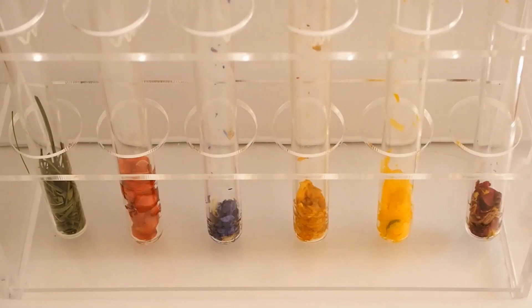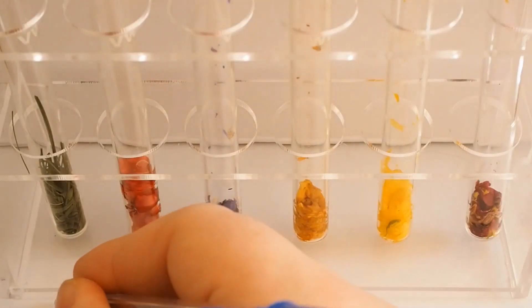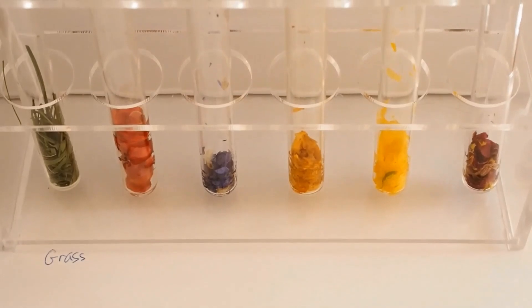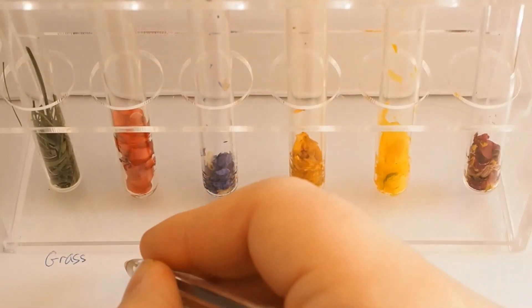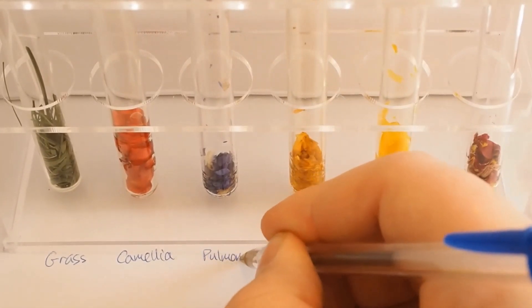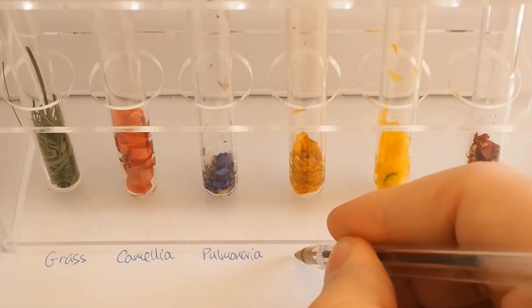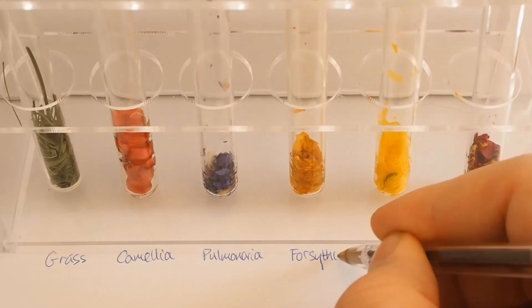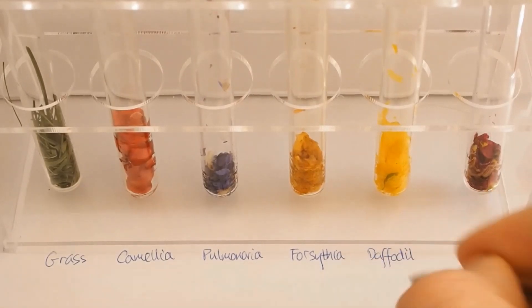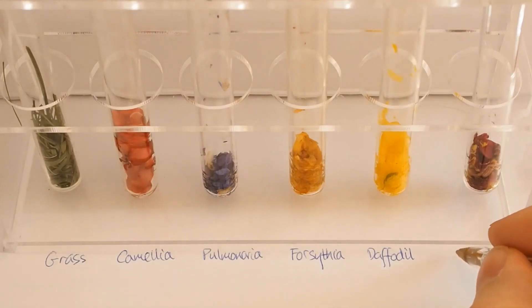That's all the test tubes filled, so let's have a look at them. Here are the tubes and from left to right we can put a little symbol so we know what they are. This one's going to be grass, this one here is Camellia, this one's the Pulmonaria or Lungwort, this one here is the Forsythia — those yellow flowers — this is the Daffodil, we'll use its common name because that's what everyone will know. And this one over here, that's the Primrose or Primula.